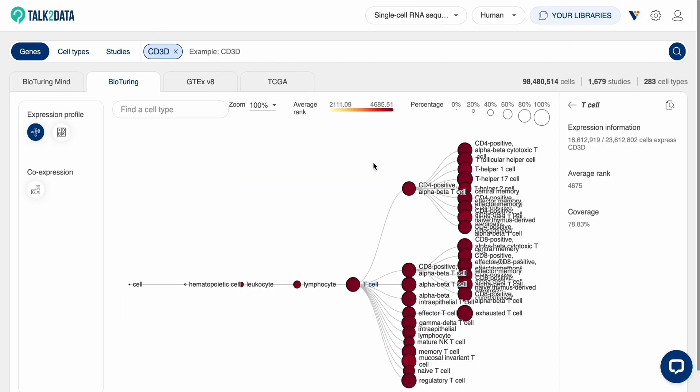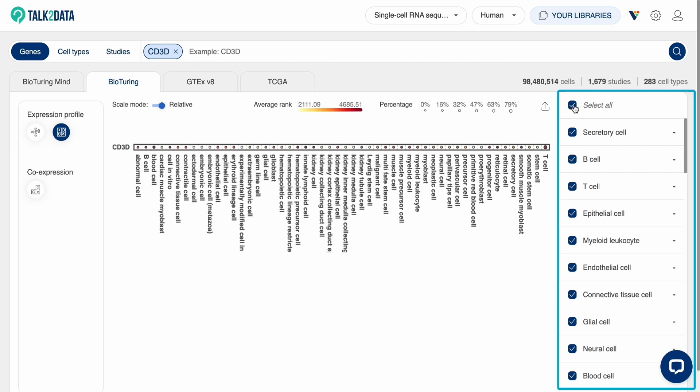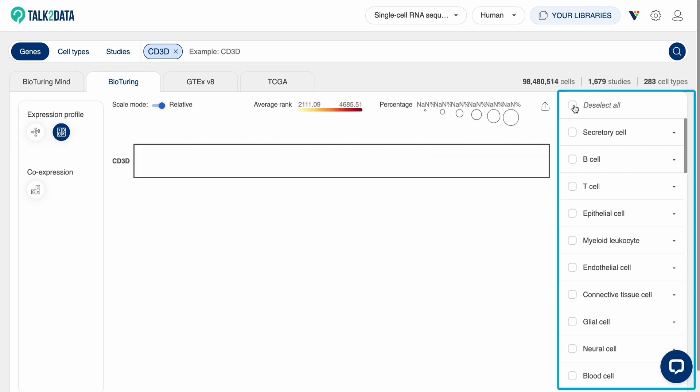Beside the ontology tree, click on this icon to view the expression in heatmap format. You can either view expression among all the cell types or select just a few that interest you.